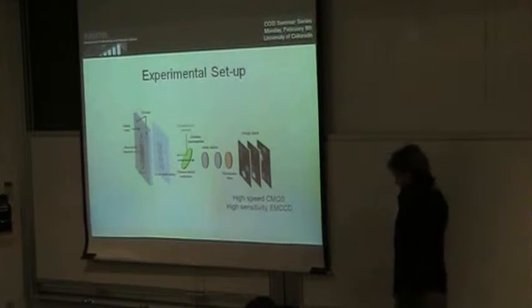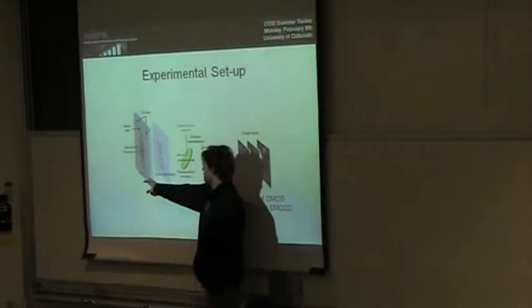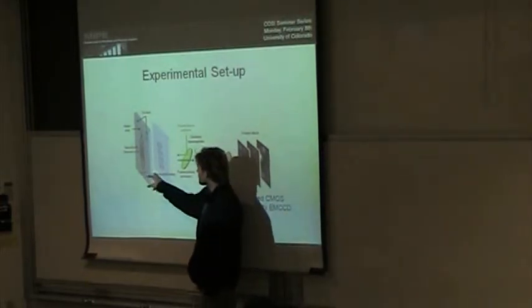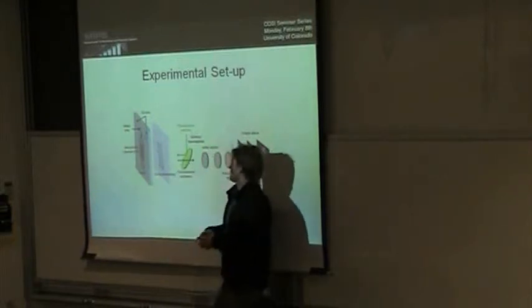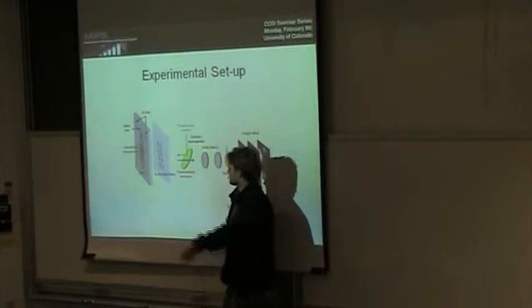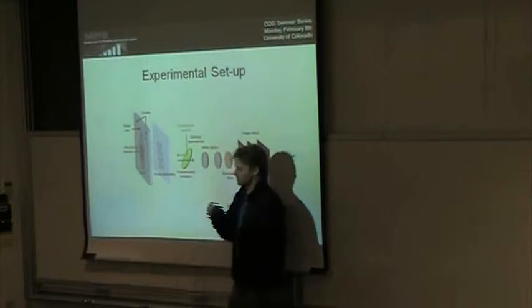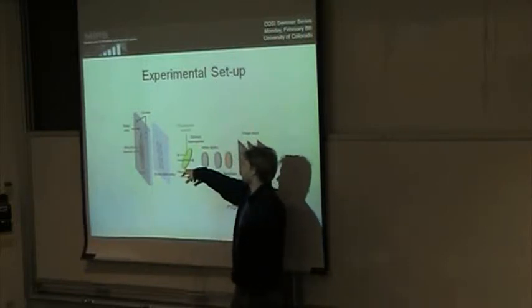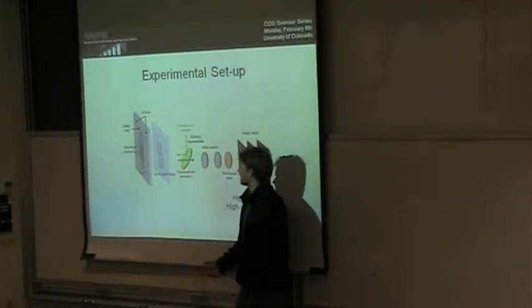So this is just a short schematic of the experiment, how this is going to work. This is our two-layer fluid optic system. How we're going to operate the system is we're going to illuminate the entire lens array with a large excitation laser. The largest array we did was an 8x8 array. That array is 2 millimeters in total cross section. That's about the size of the beam coming out of our fluorescence excitation laser.